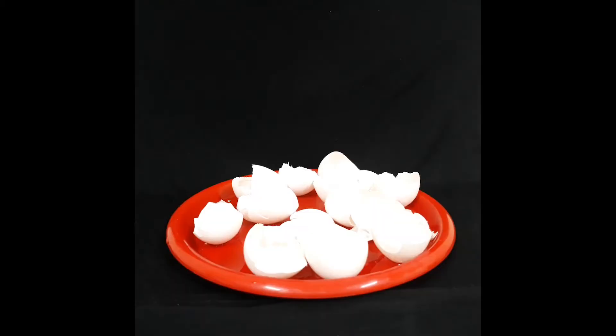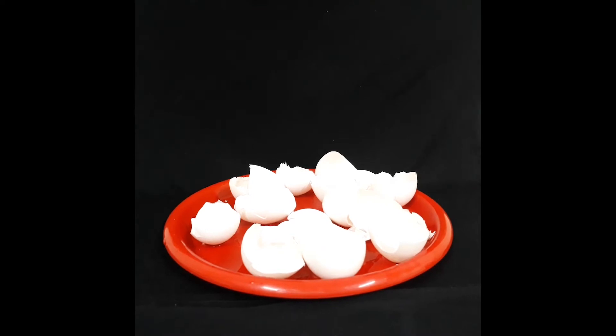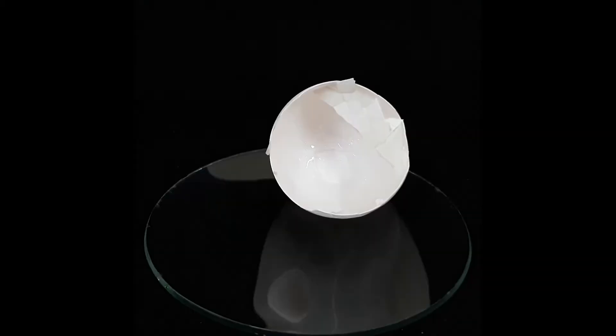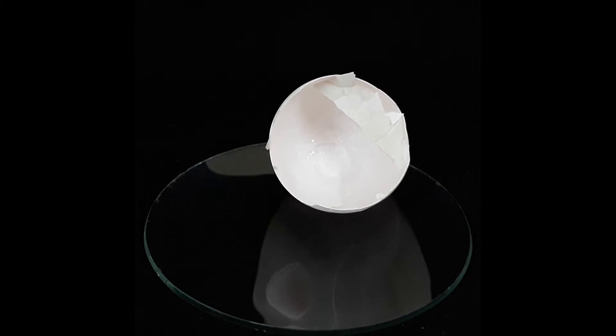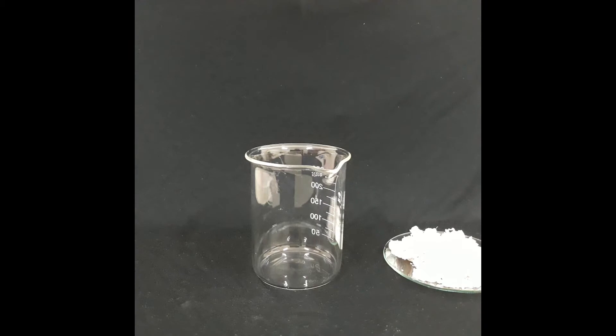First, you need to collect eggshells. I just collected 10 here. You can use the yolk sac or remove it as you want, but it will be removed anyway in the filtration step. I started adding around 100 milliliters of acetic acid 5%, which is used in cooking, onto the eggshells.